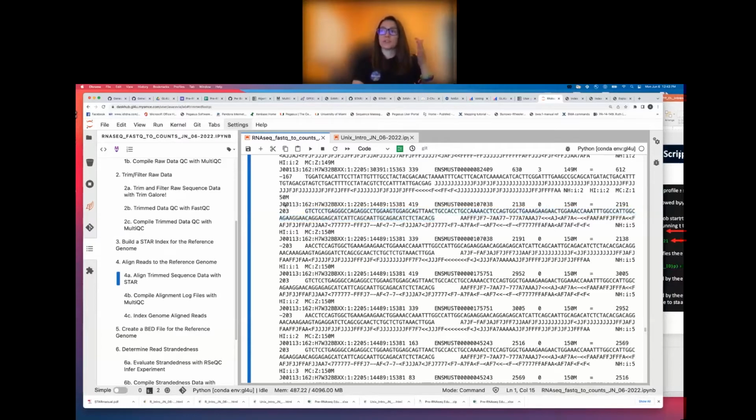And so because you have a forward and reverse read, it's going to act on the same template, which you know is the same because, again, you're given the same address in the forward and the reverse read. It knows the size of that template because it starts at the leftmost position of the forward read and it ends at the rightmost position of where the reverse read maps. And it's always going to map it with respect to the reference genome in the 5' to 3' direction. And so when it goes to align it, it will try to align it in the 5' to 3' orientation, or the reverse complement of that orientation. And so when you have a paired end read, one of them is going to be the reverse complement of the other with respect to the template that it aligns to.